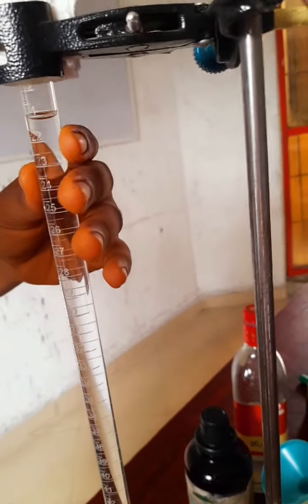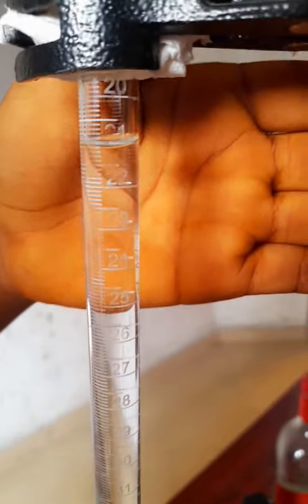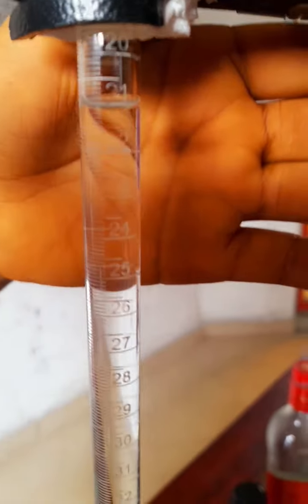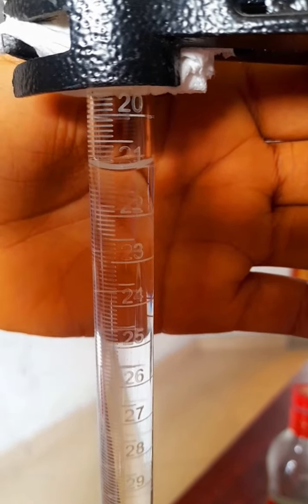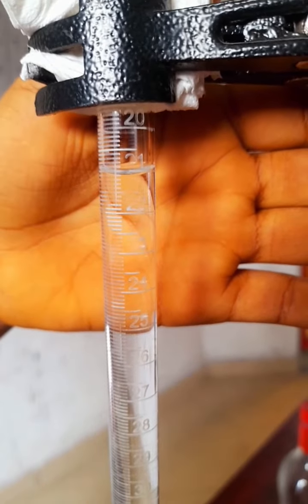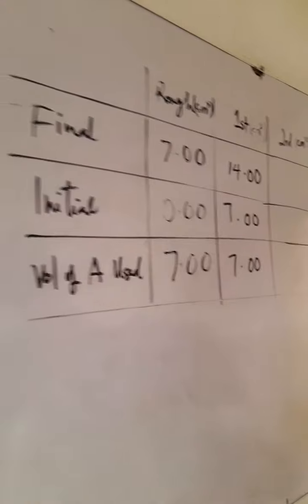Okay, so it's out now. Now we can take the measurement and we see on 21. Wow. Okay, not 21, a little bit beyond, just a little out. So we call that 21.1, because it just passes the 21 mark.